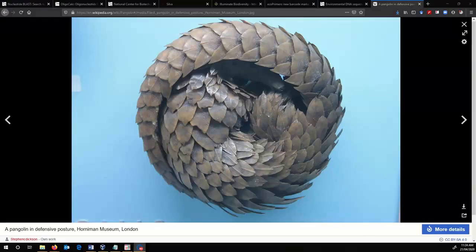I'm going to go through the way I do it mostly, which is actually mostly manual, and it's done by moving between various different websites and just one or two bits of software that are free and you can download if you want to give them a go. And hopefully that will be a reasonable way of describing the overall process so that you get an idea of it. There's a bit of an art to it, and there's lots of testing involved. But anyway, I'm going to start out with a hypothetical situation.